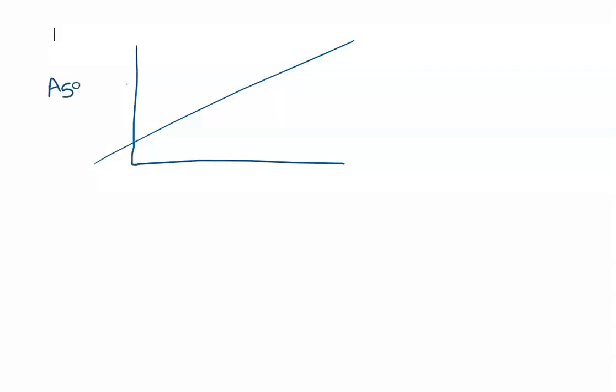Let's look at how to use the line fit equation in order to determine the concentration of our unknown sample. So this is video number 2, and we had made a graph of the absorbance at 595 nanometers versus the concentration of BSA in mg per mL for our standard curve points, and we got some equations from the line fit in Excel.